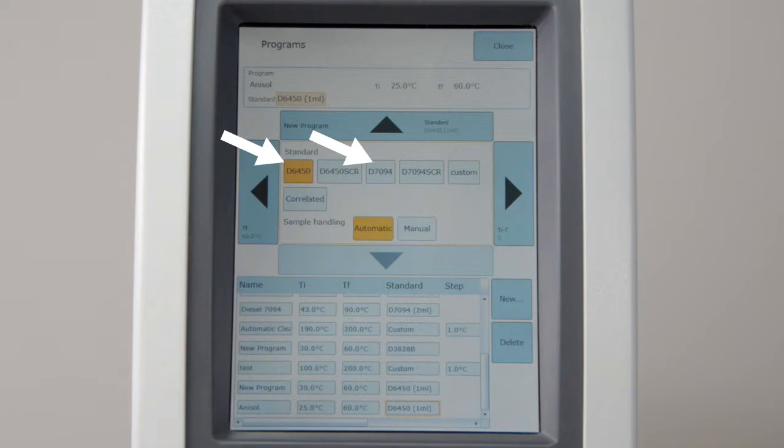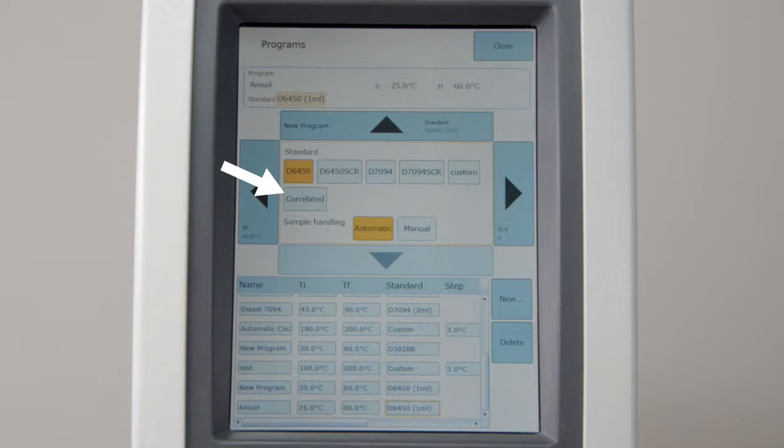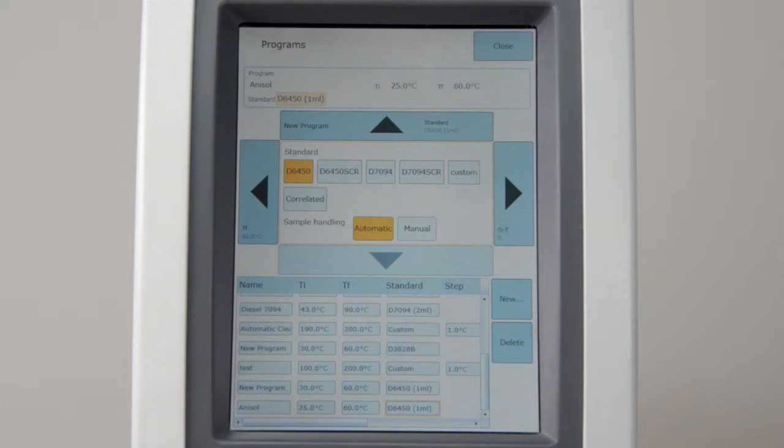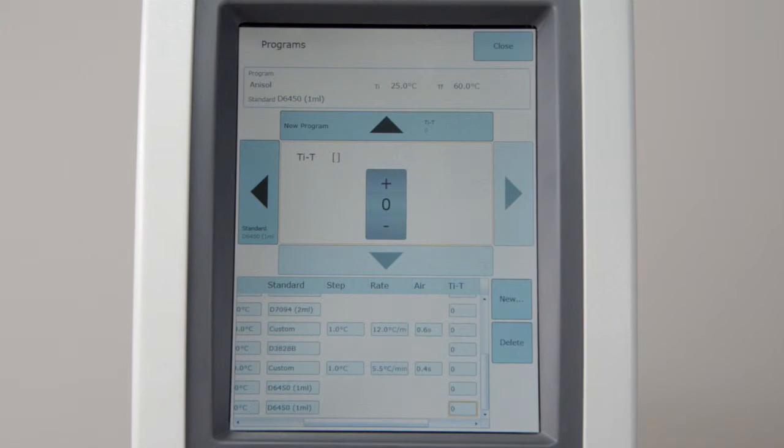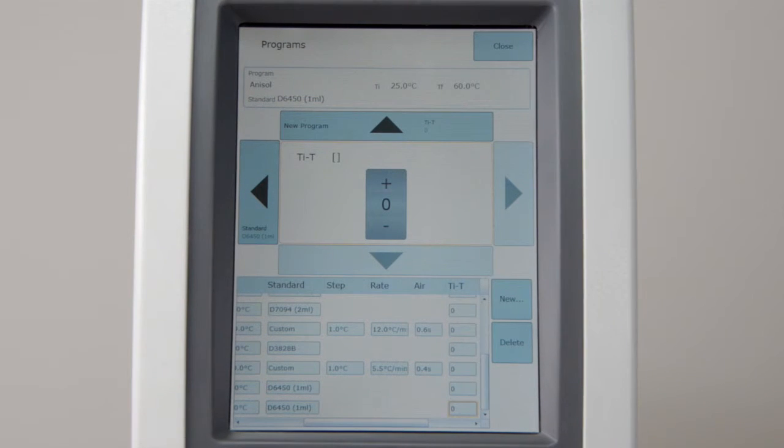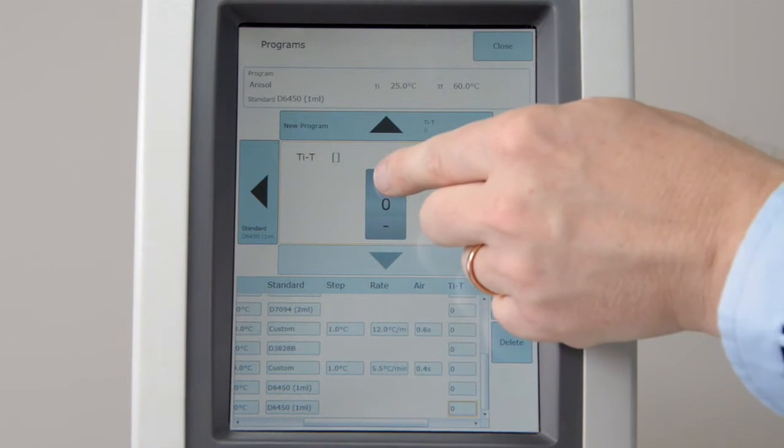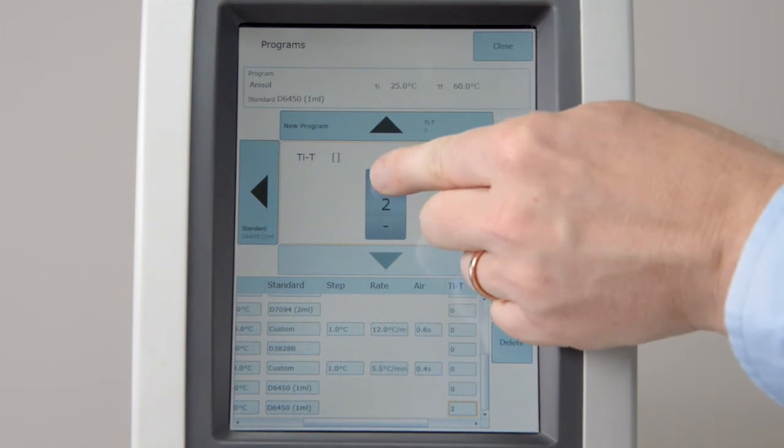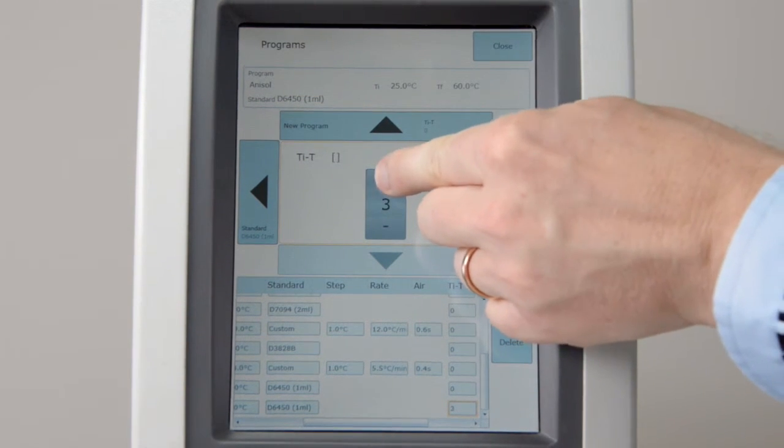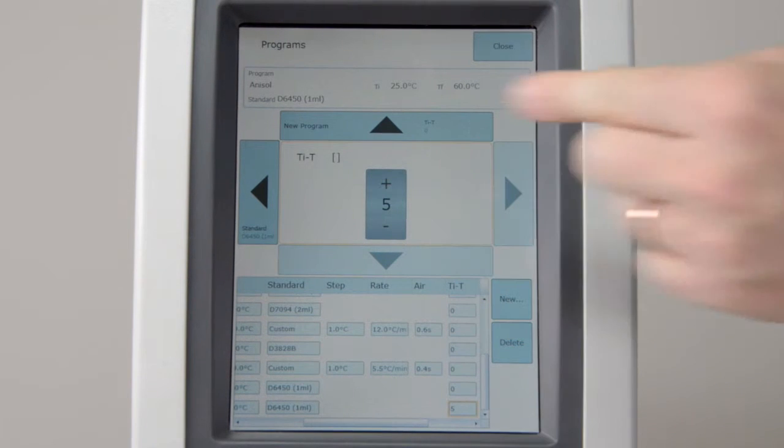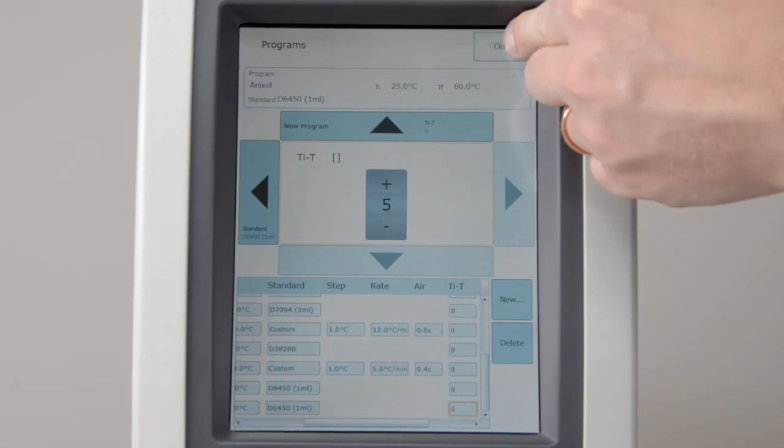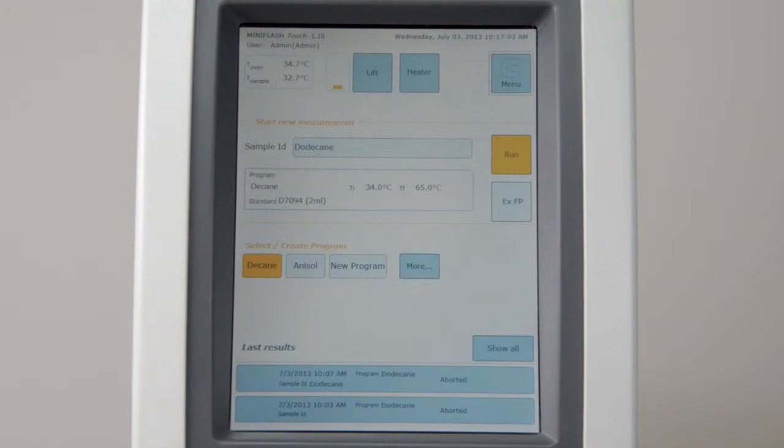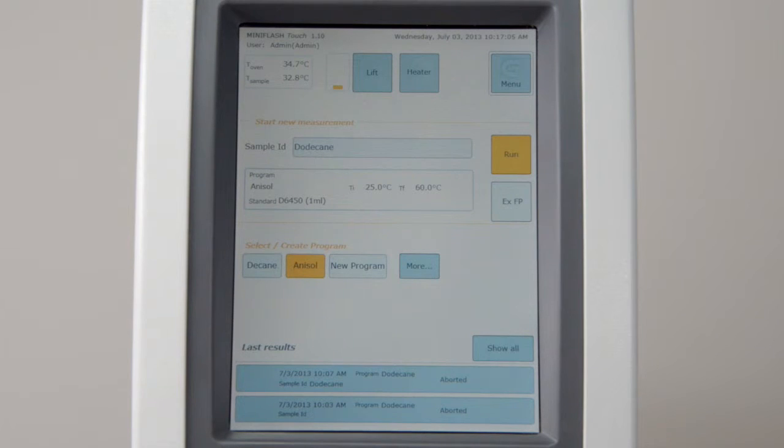Select a standard method, a rapid screening method, a correlated or a custom method. If samples are tested near ambient temperature, increase the TI T value to cool the oven below the starting temperature. Press Close to finish the program. It will be automatically stored in the program list.